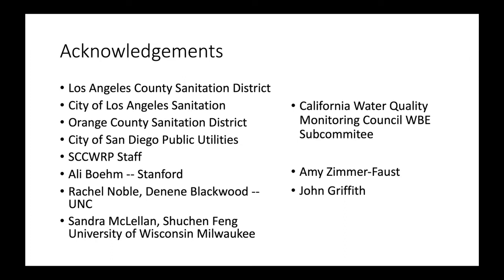Okay, if anyone has a question that hasn't been addressed yet, feel free to add it. I think there was one more, and I believe you addressed it: is the virus live in the wastewater, and have you done any plaque assays or the like to correlate the PCR data with other parameters? Is this a question about how you know whether we're seeing an active infection, or somebody at the tail end, pardon the pun, just residuals?